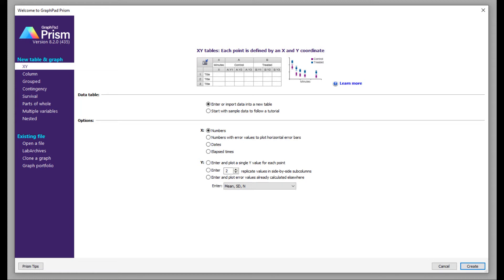I am your host Lokinder Kumar and today I'm going to show you how to use GraphPad Prism. I'm going to make a series of videos on GraphPad Prism where I'm going to show you how to plot line charts, column plots, group plots, as well as nested and survival plots. Right now what you're seeing on your computer screen is the main window of GraphPad Prism. When you click on the software you will get this pop-up window and you need some option settings to start with the plotting. In this video I'm going to provide you an overview of the GraphPad Prism software.